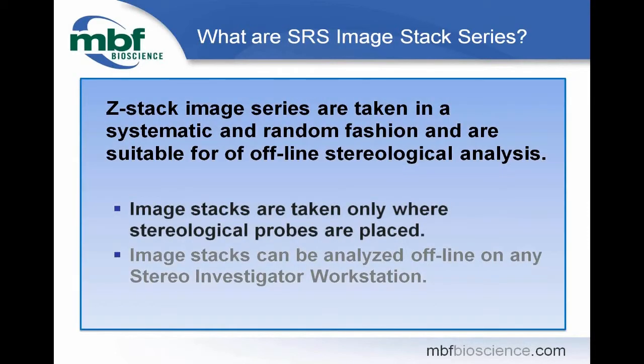SRS Image Stack series, then, are a group of image stacks acquired in a systematic and random fashion and are suitable for stereological analysis. Image stacks are taken only where stereological probes will be placed. Image stacks can be analyzed offline on any Stereo Investigator Workstation.